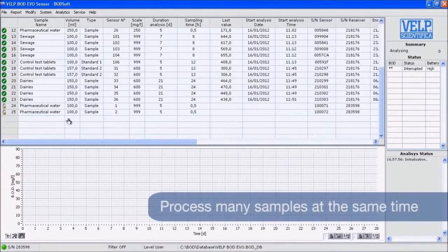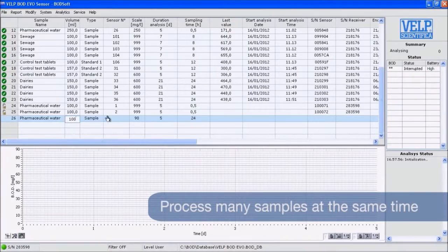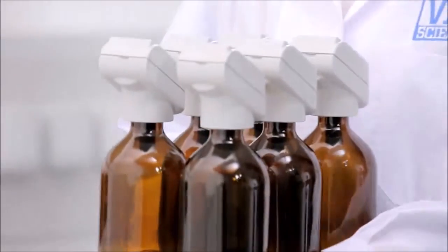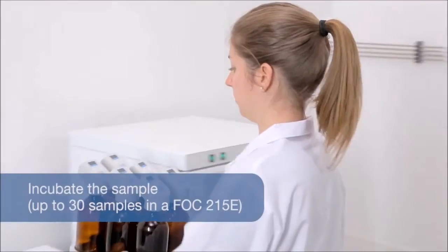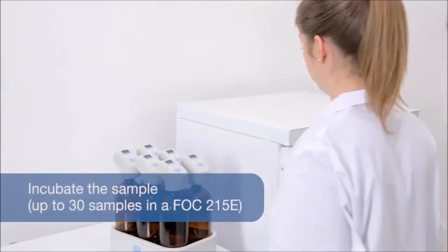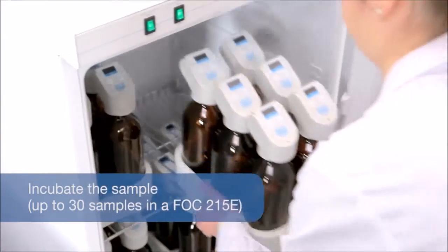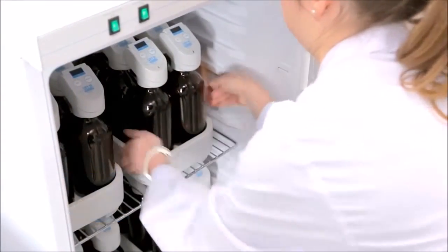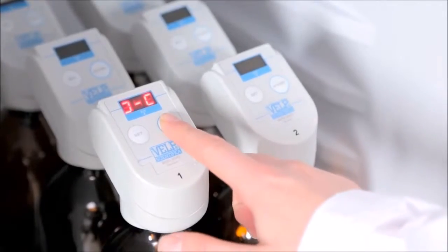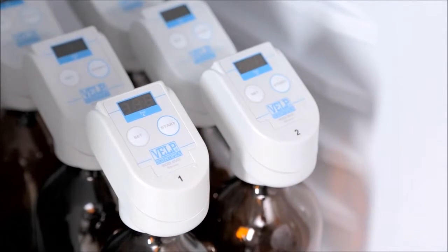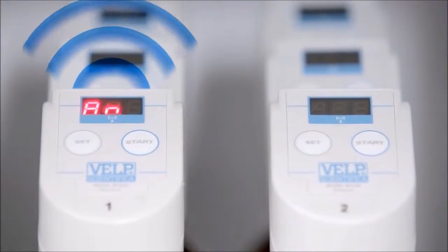Once having programmed the sensor through the BOD Soft, the samples need to be incubated and gently stirred. Up to six bottles can be loaded into the VELP Stirring Station with maximum convenience and simple handling. The extremely compact stirring station ensures constant stirring, remaining cold even after continuous use.